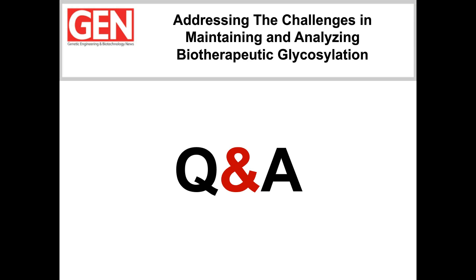And Shahir, a question for you. You mentioned that Vanquish has four detector options. Is there the option to have more than one of these options on a single instrument?